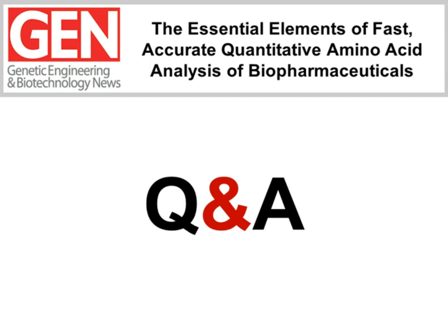In any derivatization, in any part of analytical chemistry, of course, that is the hardest thing to recognize. In the case of this amino acid analysis reaction, our best indicator of completeness of the derivatization is to take advantage of lysine. Lysine has two amino groups, so that in the normal reaction it derivatizes at both the alpha and the epsilon amino group.